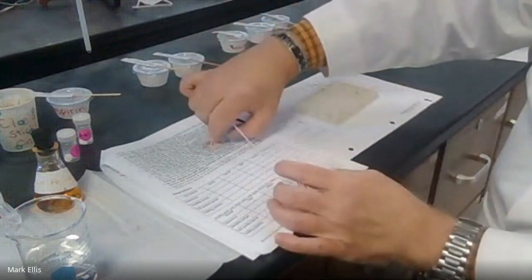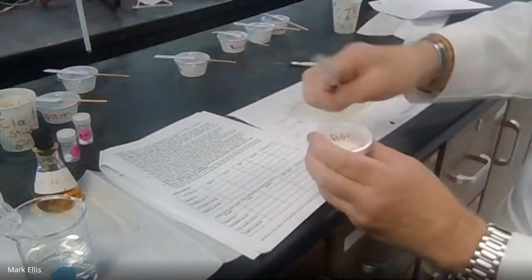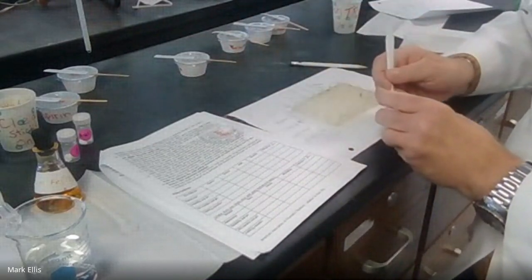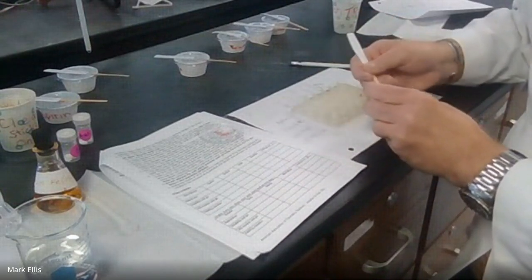Once I'm done, put the cap back on, put it aside. Third column is Advil, also known as ibuprofen. So I got the spatula for ibuprofen and the cap for Advil. Those are the same thing. And that's going to go in every well of the third column. And that's probably a little bit too much there, but that's okay.